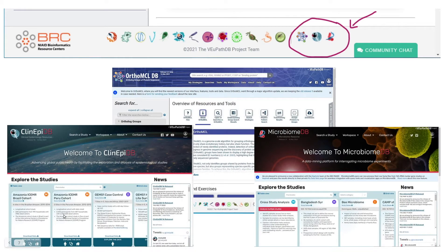If you scroll to the bottom of the page, these are the links to the other sites. The icons on the right are for other related sites with a slightly different layout. OrthoMCL can be used to investigate gene homolog relationships of all genes in parasite, fungi, and VectorBase websites, and even genomes outside these. ClinEpi is for exploration and analysis of epidemiological studies, and MicrobiomeDB is a data mining platform for interrogating microbiome experiments.